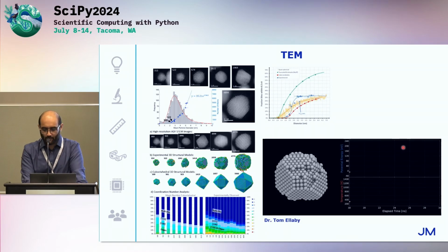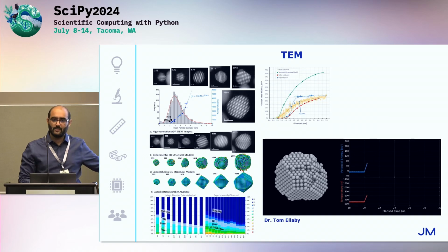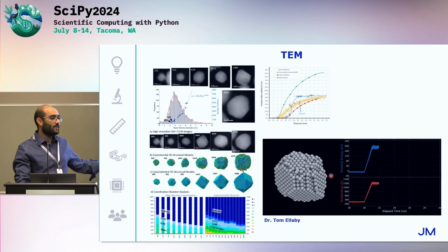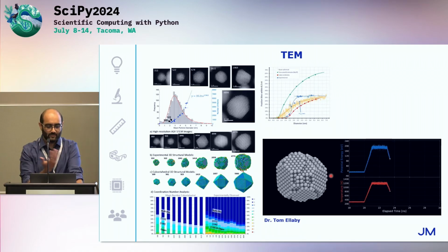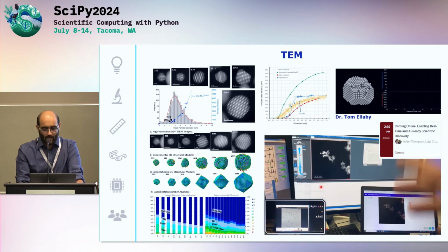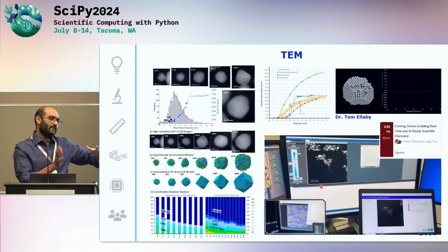This is also very, very powerful because not only can you interrogate these models, you could do other things, right? You could do simulated annealing experiments. You may also be able to perform what-if scenarios of what is going on with your system, or, I don't know, you may try different molecules and see how they stick on top of these facets, that type of work. And tweaking these parameters actually moves us closer to better particle design overall.